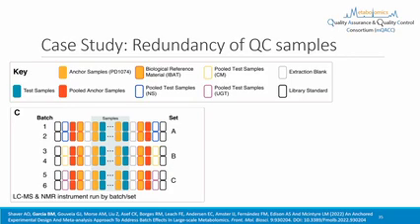So they start out with a library standard, then a phenotypic pooled QC, a control pooled QC, a matrix match reference material, a blank, and then the reverse is done at the end of the batch. And in the middle are their QCs and their test materials in iterative batches.